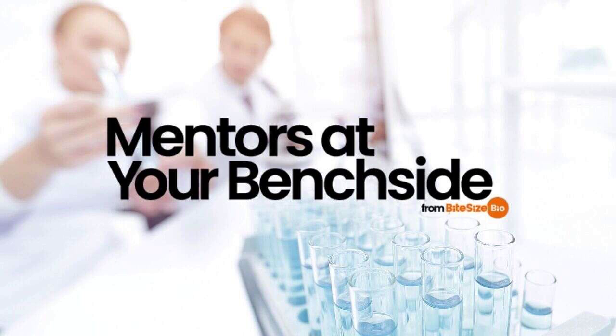Once you wash with 70% ethanol, the pellet becomes visible. When you are ready to resuspend your pellet, you'll know exactly where to find it because you marked the tube.